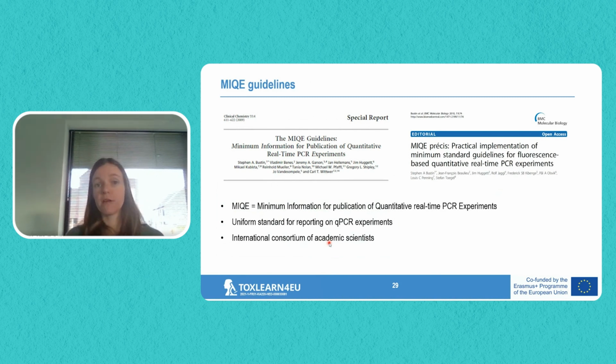So in general, these were the best ways to represent your data. And by showing the data in this way, you are transparent regarding the uncertainty in your data. And then people who read your publication can decide for themselves whether or not they trust the obtained results.